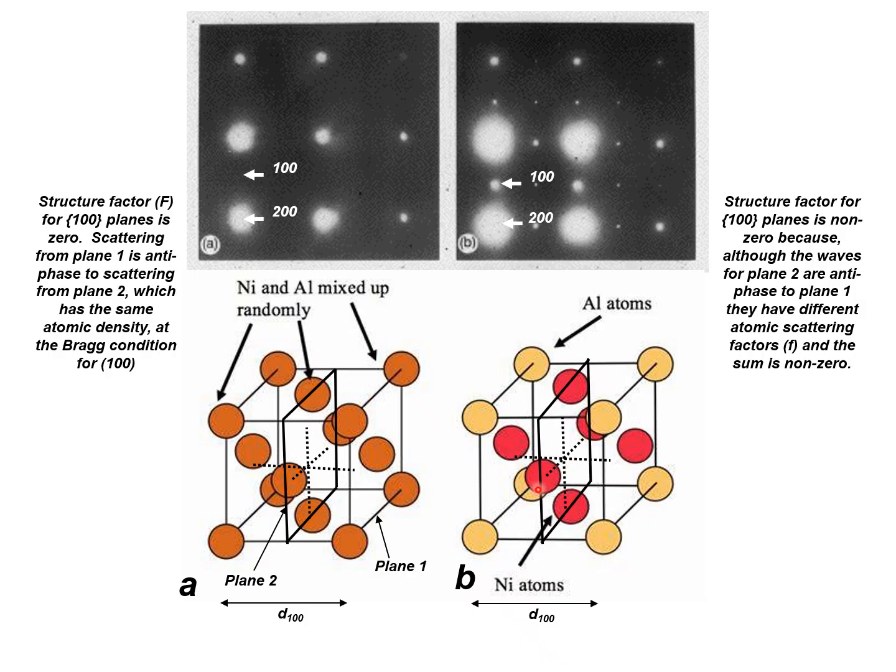But because the atoms on what would be the 200 plane are nickel atoms in this case, when you've got aluminum atoms at the corners, so you have nickel 3 aluminum in this particular case, there's a difference in the atomic scattering factors from these atoms, and the contribution turns out to give you a net intensity for that 100 reflection.